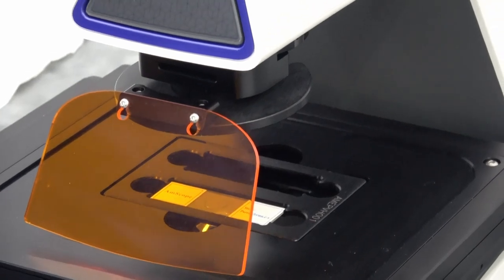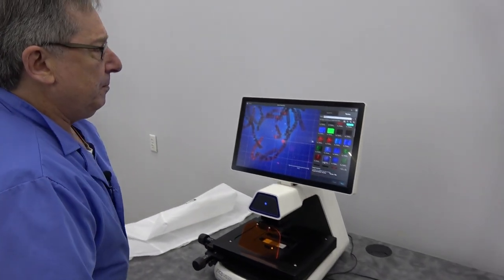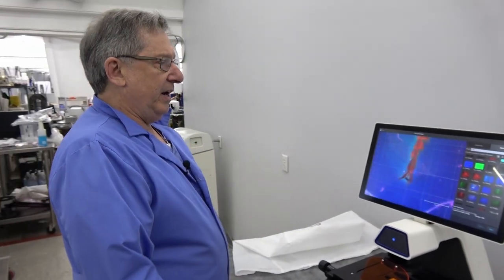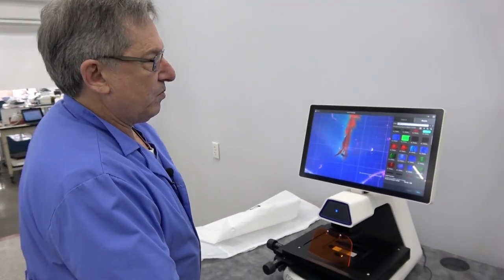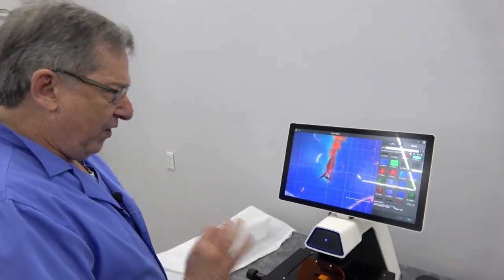It does all sorts of features. We're going to get into that a little bit, but the images are very easy to create—these composite images within very quick time.